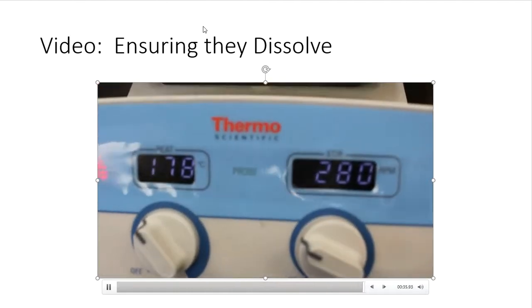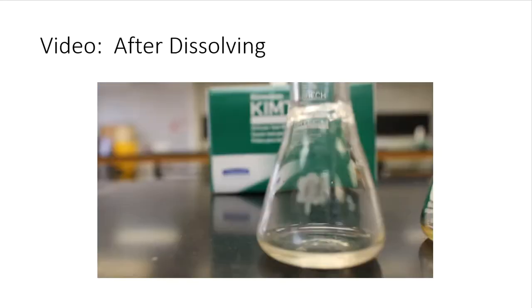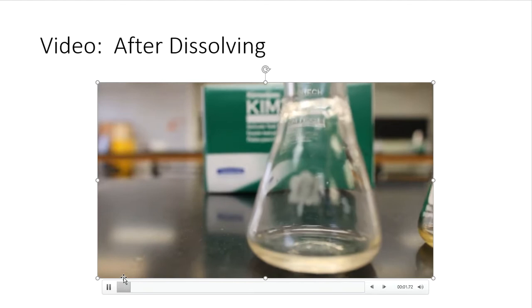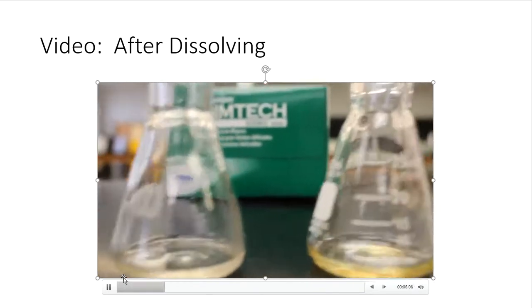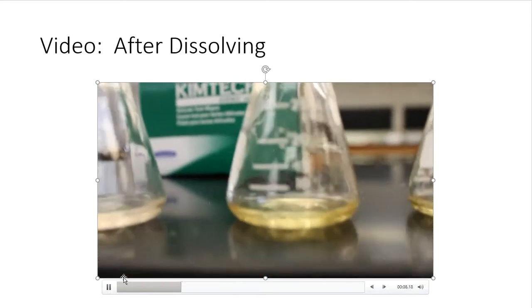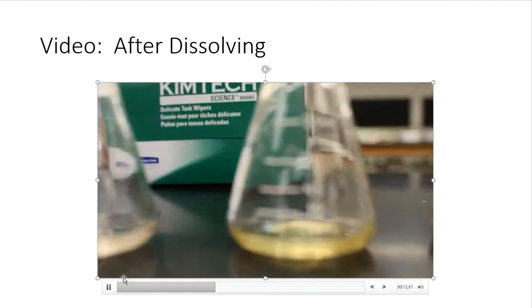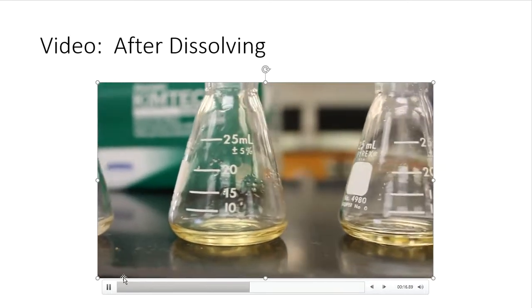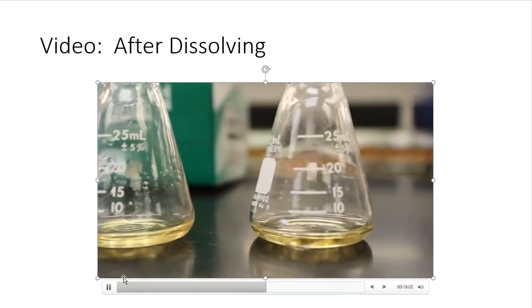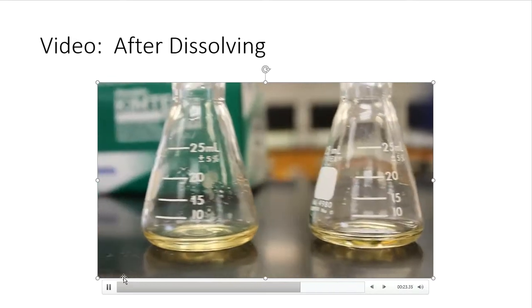All right, so there's the settings for the hot plate. Again, very, very low. So I'll leave them on there for like 5 or so minutes. It doesn't take a long amount of time at all. And I take them off the hot plate. And folks, this is what we end up with now. So I think by showing you this video, we feel a little bit better about the reaction after this. So they are going to be dissolved. I can see them. No crystals around in that solution. Bye-bye, crystal. We can go on to the next one.